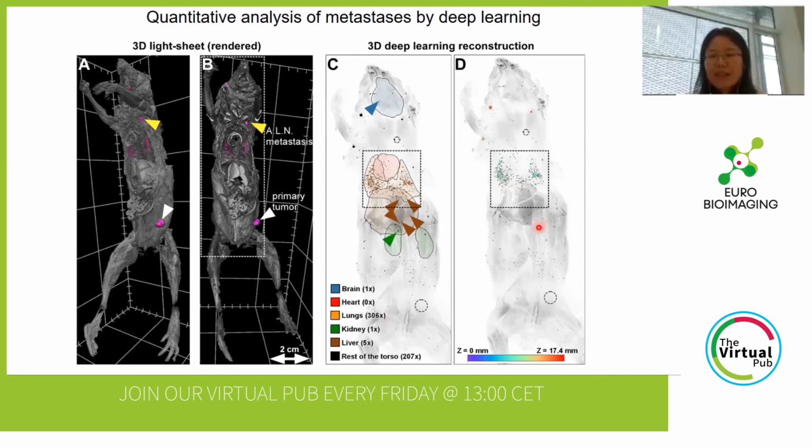In figure D, we can see the depth of the signal across the Z direction, and how many of the metastases happened.